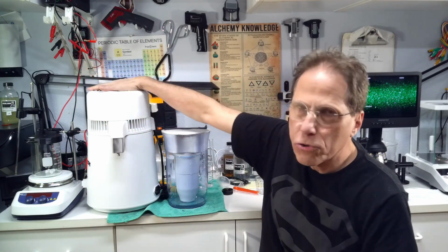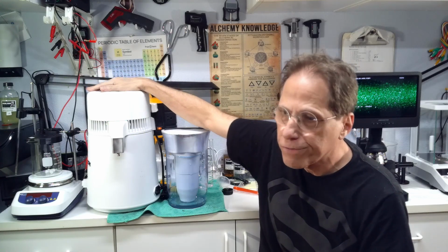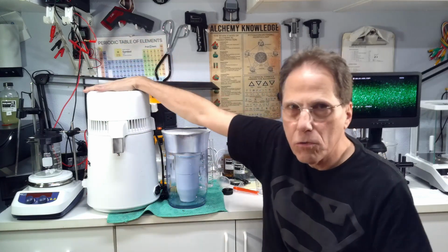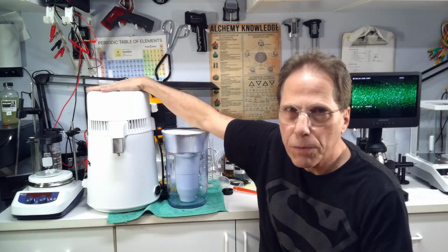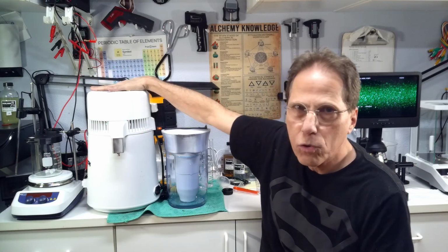Now, these are not commercial grade distillers. They're general purpose distillers that are good for basically general purpose stuff. They're not commercial grade, let's put it that way. So if you try to distill well water, like my well water is 150 parts per million, if I distill well water in my distiller, I will get anywhere between 2 to 5 parts per million water on the way out. It will not take everything out.